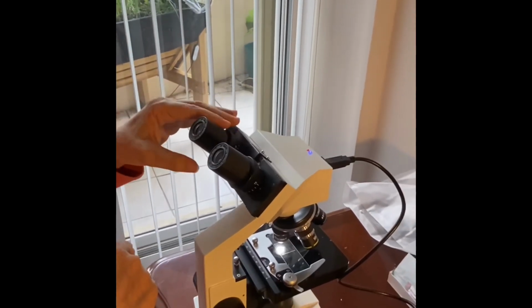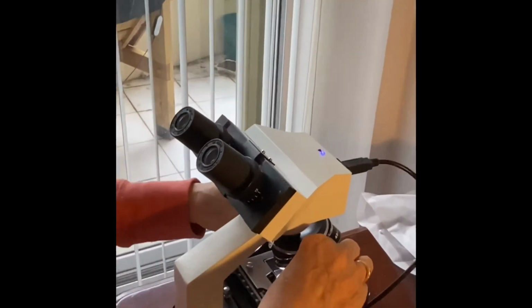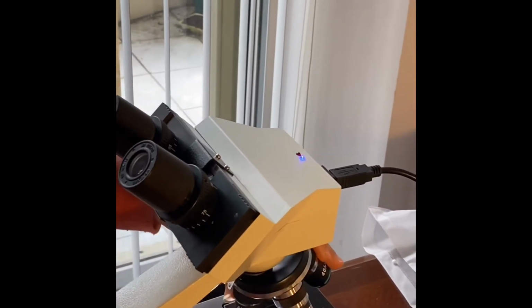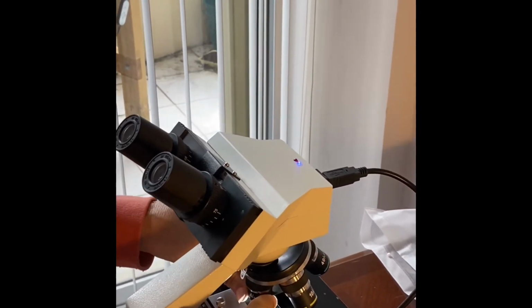It will be 10x in all microscopes. And then, depending on the objective lens that you are using, and in this case, I have it on the lowest, it's at 4x.